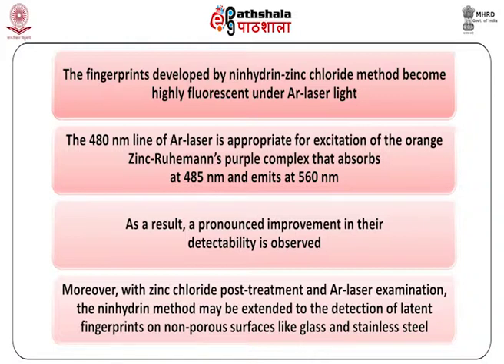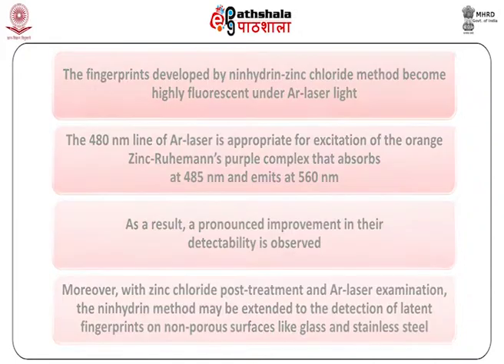Moreover, with zinc chloride post-treatment and argon laser examination, the Ninhydrin method may be extended to the detection of latent fingerprints on non-porous surfaces like glass and stainless steel.